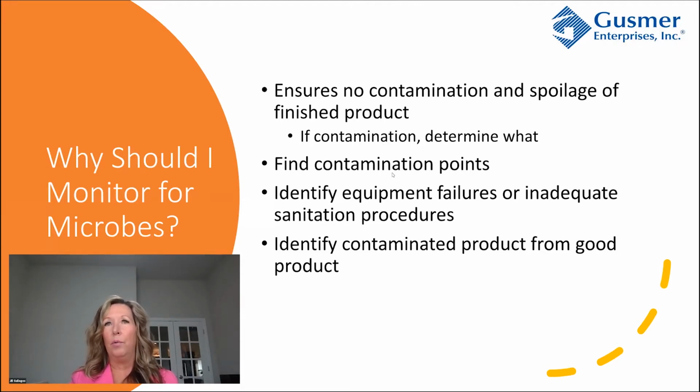And then we'd like to identify some contamination points that may be contributing to contamination in the brewery, identify equipment failures or inadequate sanitation procedures, and identify contaminated product from good product.